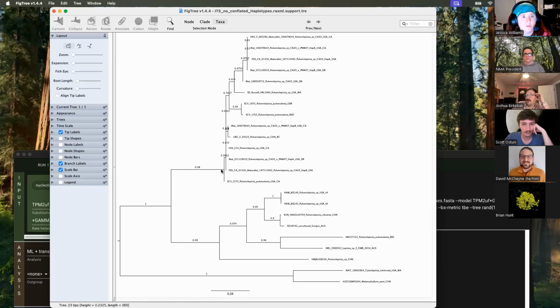This would be a great candidate for some other gene regions. It would be very interesting to see if TEF1 and RPB2 have two very distinctive haplotypes. This is an ITS-specific thing, where you get weird genomic issues with the ribosomal array where you could get two distinct haplotypes entrenched in a population. There are weird genetic reasons that this could actually be one species with two discrete variants that are evolving consistently and independently. I don't know. Fungi are weird.